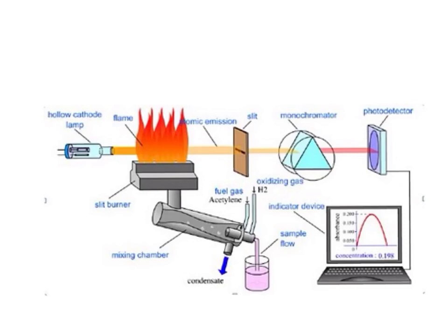This is a typical setup for some atomic absorption spectroscopy. This is our transmitter. The light travels through the flame, and any light transmitted collects on a detector here, and the signal is put out on a TV monitor. This piece of apparatus is designed to suck up a solution of your sample. It gets mixed with a volatile and flammable gas so that when it gets into the flame it burns well and produces atoms of the metal that you're analysing.